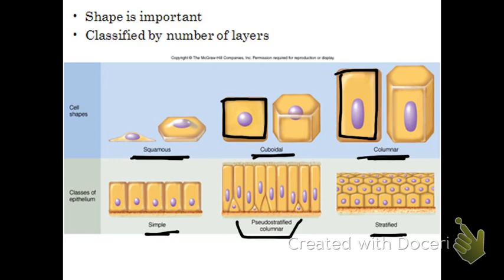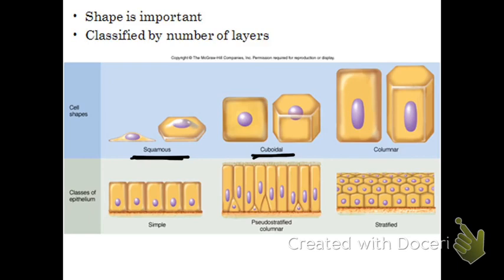One thing I want to introduce to you right now is this dark line at the bottom of the epithelial cells. So that brownish line, I've now made it black, is called the basement membrane. And the basement membrane is a layer upon which the epithelial cells sit. And below the epithelial cells and below the basement membrane will be found a layer of connective tissue.